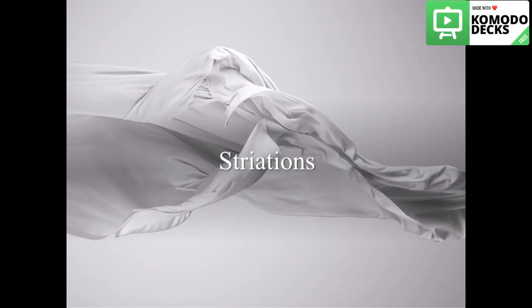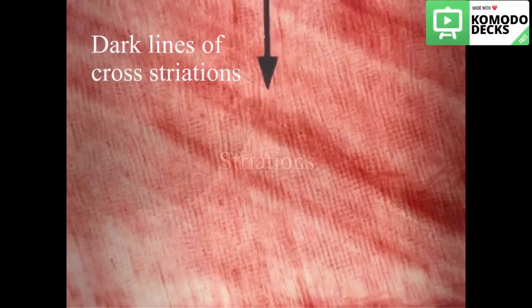So we have two kinds of striations, incremental lines in enamel: the cross striations and the striae of Retzius. The dark lines that cross the enamel rods at a 90 degree angle are the cross striations.